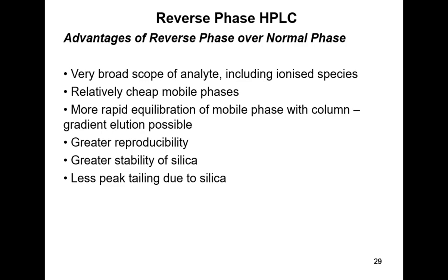It's much more versatile than normal phase. Above a certain polarity of your sample molecules, the retention times get far too long to be useful. So normal phase is really mostly useful for relatively non-polar molecules.